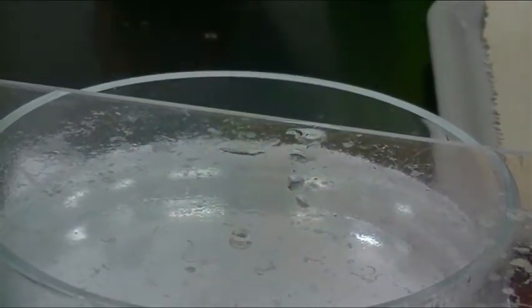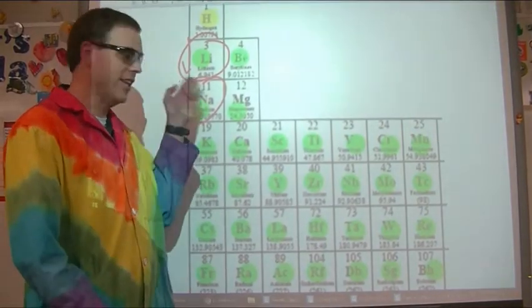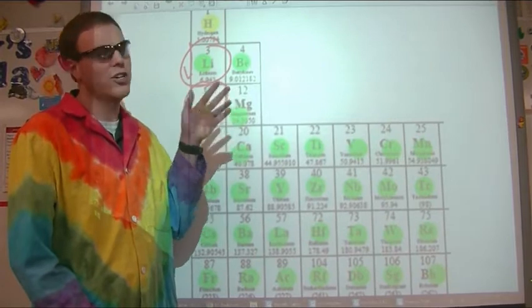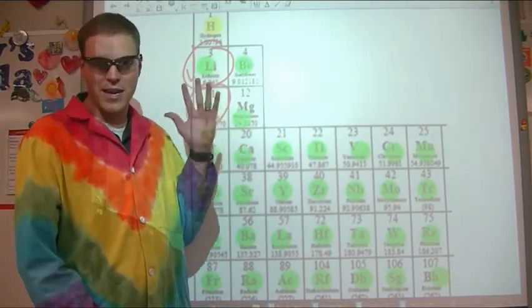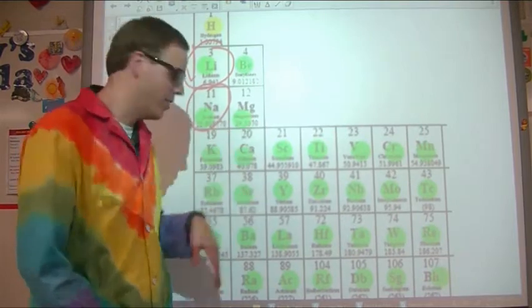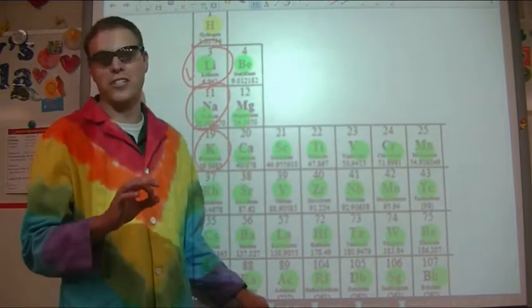All right, so it increased its reactivity by a little bit. Let's see if we can't get it to increase again. All right, kids. So we did lithium. It's like a little ducky calmly swimming on the pond. Sodium was a juiced up duck. Maybe it had some pixie sticks. I don't know. But now we're going for potassium. It's going to be a lot more sauce on this one.